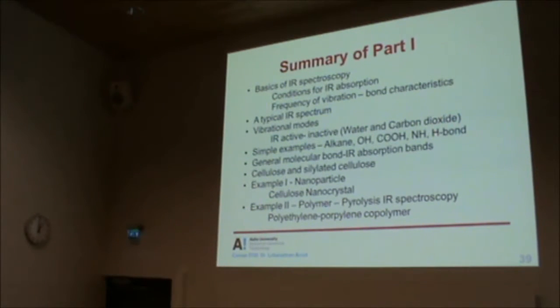We also saw the effect of hydrogen bonding, and the conclusion from this is that you should not have any water. From these two, the vibrational modes and simple examples, in your infrared samples you cannot afford to have any water. And we also saw this generalized table showing regions where different functional groups give absorption, and then we saw cellulose, and one example where infrared spectroscopy was helpful to follow the reaction where the hydroxyl was converted to a trimethyl silyl group.